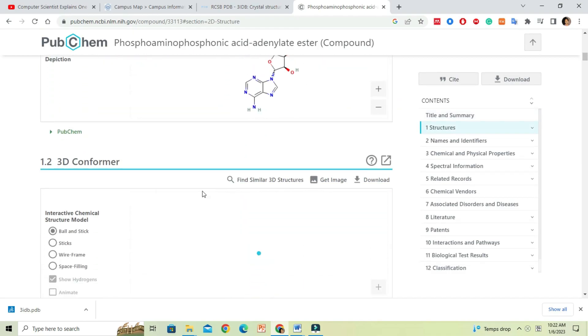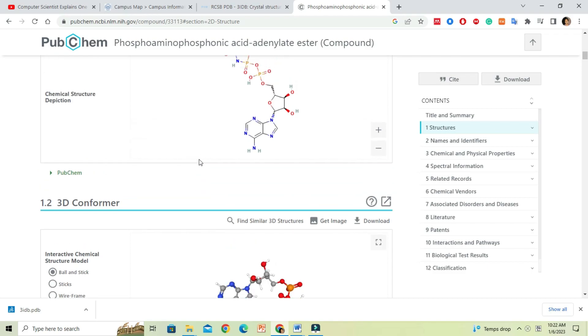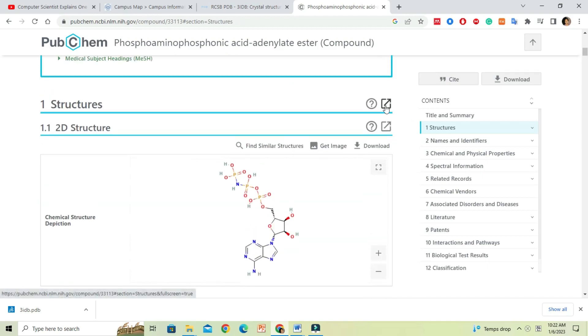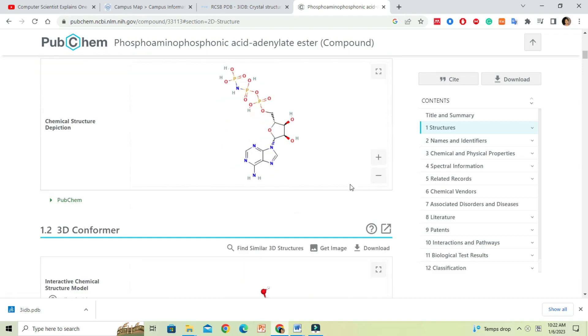Here we can download both 2D and 3D structures of the ligand. If you click on the download button at the right hand side corner, you will see different formats available for download.